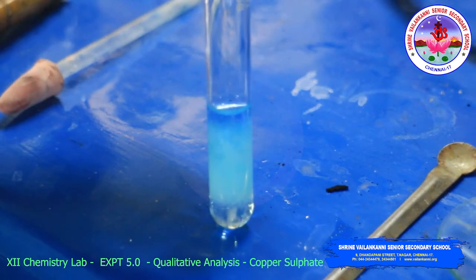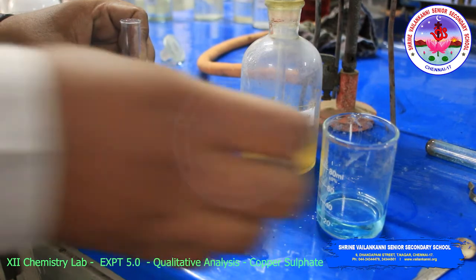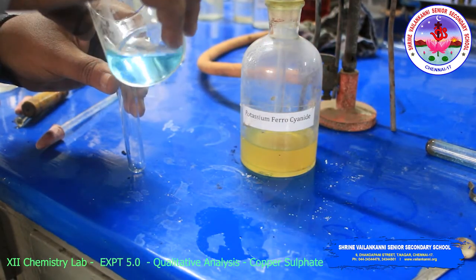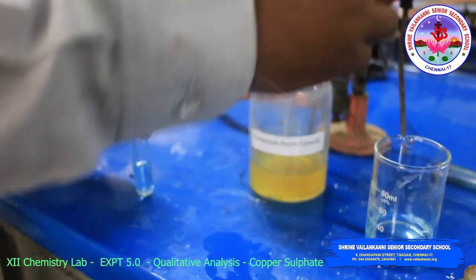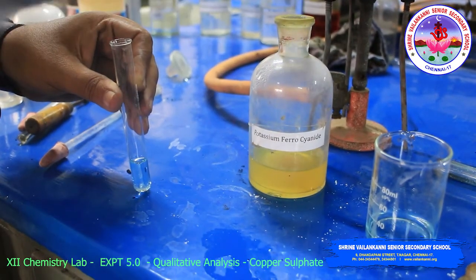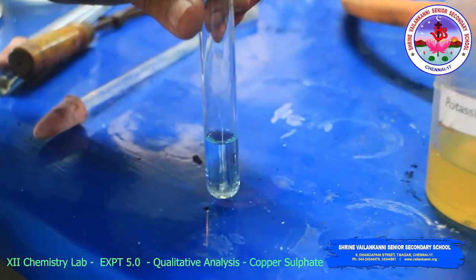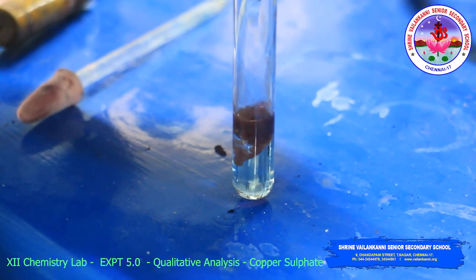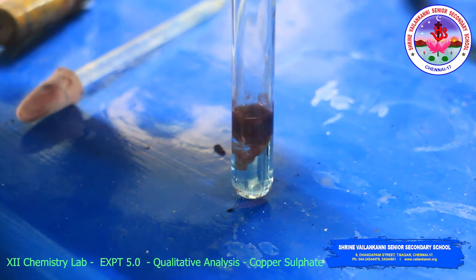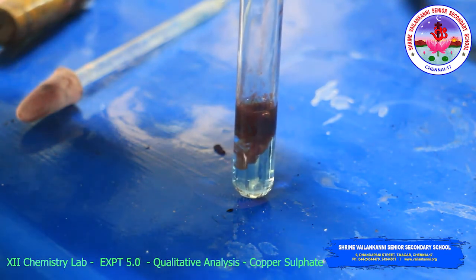Then the next test is the potassium ferrocyanide test. Add potassium ferrocyanide to the original solution. A chocolate brown precipitate means copper is confirmed. Look at this chocolate brown precipitate. Can you see the chocolate brown precipitate? So this indicates copper is confirmed.